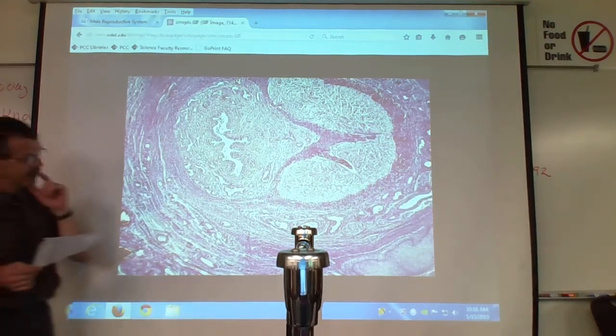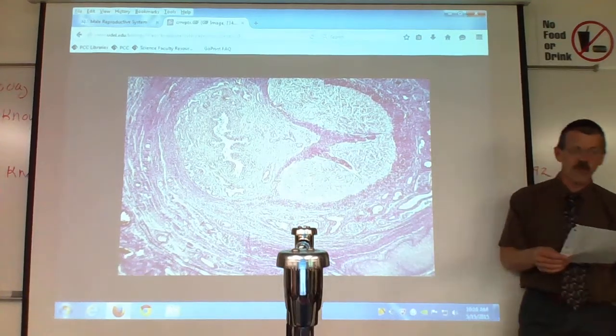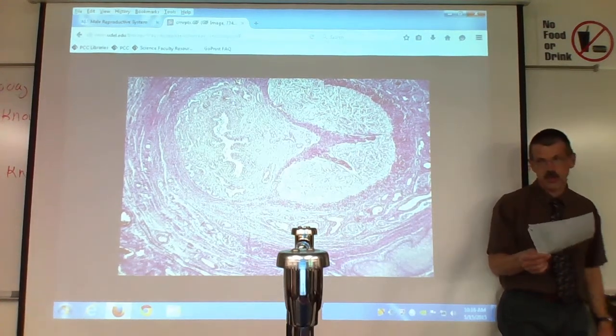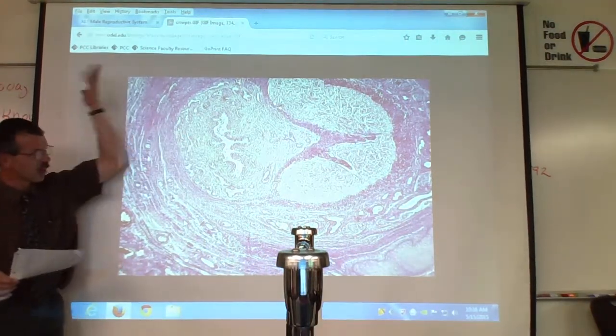Okay, so the trick is, what do you call these little holes in the spongy stuff? What's in there? Venous cavities. That's where blood fills. So the venous cavities are what you would call the spongy-looking material, all around. Yep. Okay. In general, venous cavities.